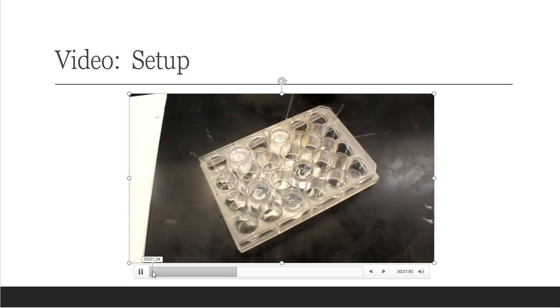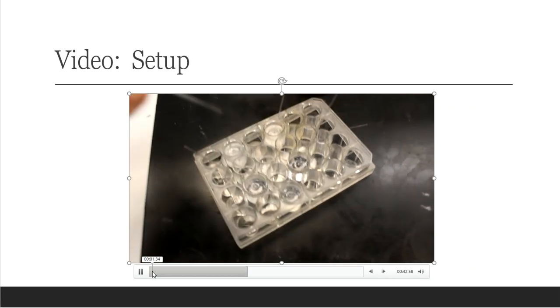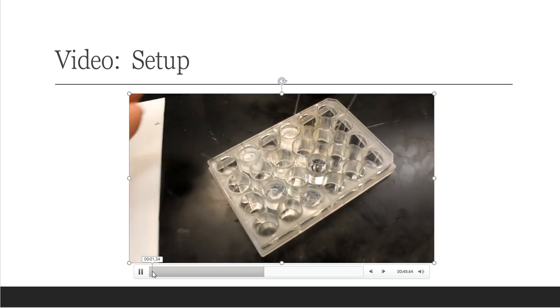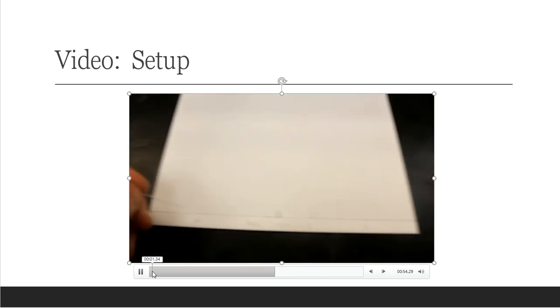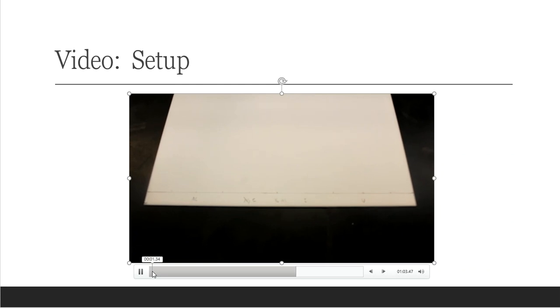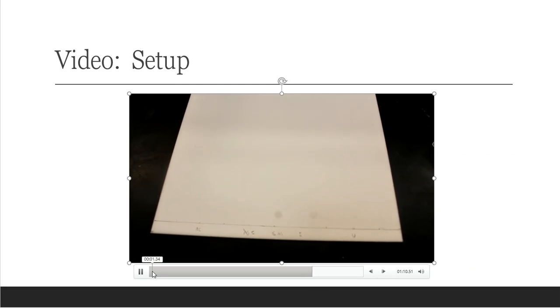Over here is our spot plate. So I've dissolved a little bit of crystal with some ethyl acetate into each one. I gave it a good stir. And I put these really small capillary tubes inside of each spot well. And then this capillary tube is like a straw. It sucks up that liquid and it holds it for me. And then I just take this capillary tube and I just give it a little dab. That's all that you need. So I did one dab for each one. I let it dry, and then I come back after it's dry and I redo it a second time, sometimes a third time if you think that you don't have enough of it.